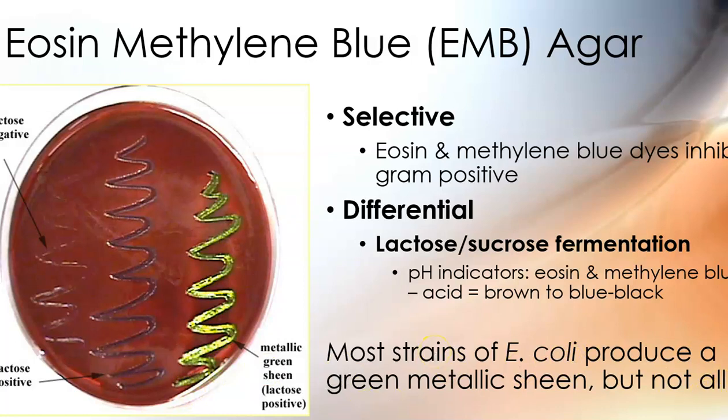There is one thing that you need to understand, and I'm going to repeat this probably 5 times before you're done with all of the micro classes. Staph aureus is not always beta hemolytic. E. coli is not always a lactose fermenter. You're going to be like, I swear this is E. coli. It has that smell and blah blah blah, right? It is E. coli. Trust your gut. Prove it. But yeah, it's probably E. coli. There are non-lactose fermenting E. coli. I told you today, bugs do not always do what we expect them to do. E. coli and Staph aureus are everywhere, and you just expect them to be anywhere.